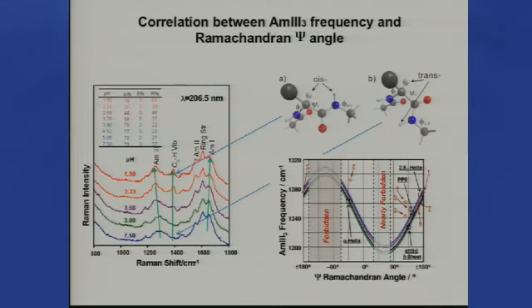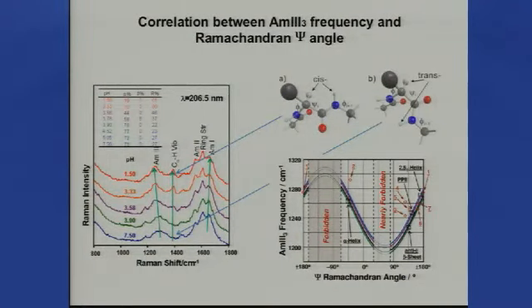And it turns out that in the NH bending, you find that it's coupled with C alpha H bending when the C alpha H and NH bond lie on the same side of the peptide, and there's intimate coupling. That occurs in an extended conformation, like a beta sheet, for example. On the other hand, when you're in an alpha helix conformation, the C alpha H bond and the NH bond are trans to one another, and there is no coupling.